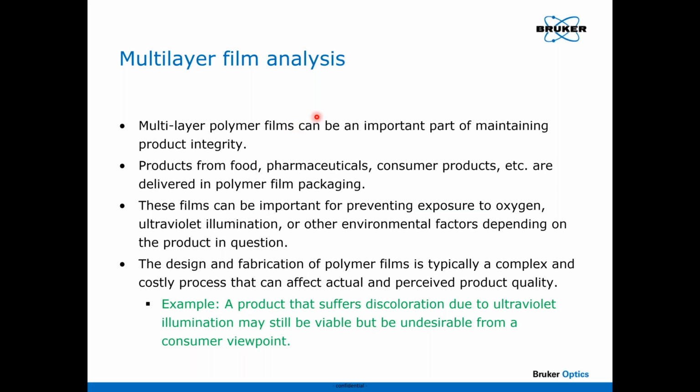So let's do a couple of fun multi-layer film analyses, and I'm going to give two good examples. One is using transmission, where I'm going to cut the polymer thin, and the second will be ATR, where in that case I'll just stand it on end and cleave it, and I'll put it into a microvise, which I'll show you for doing the analysis.